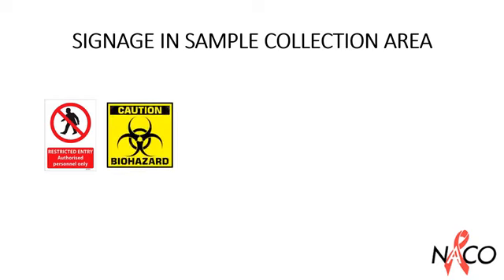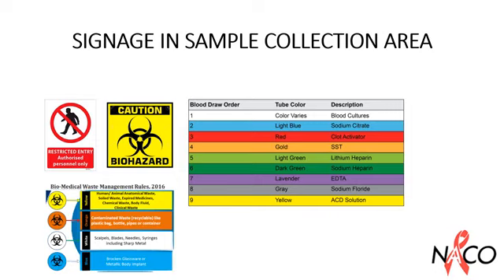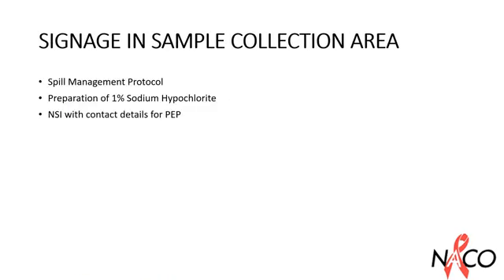The following signages are encouraged in sample collection areas, preferably in local language again. Restricted entry, the biohazard sign, order of draw of sample, instruction for biomedical waste management. The spill management protocol should be displayed, preparation of 1% sodium hypochlorite solution, needle stick injury with contact details for post-exposure prophylaxis, counseling, testing, drugs and follow-up.